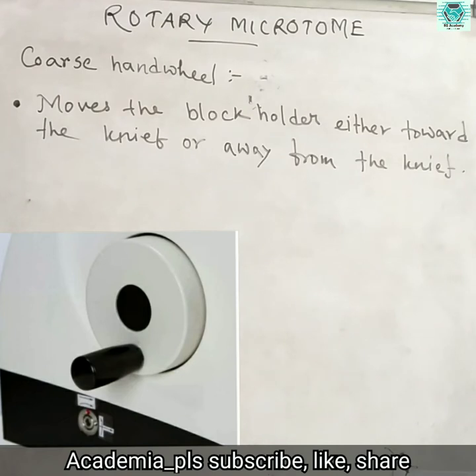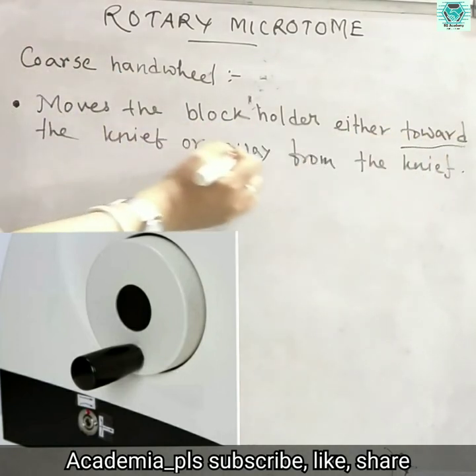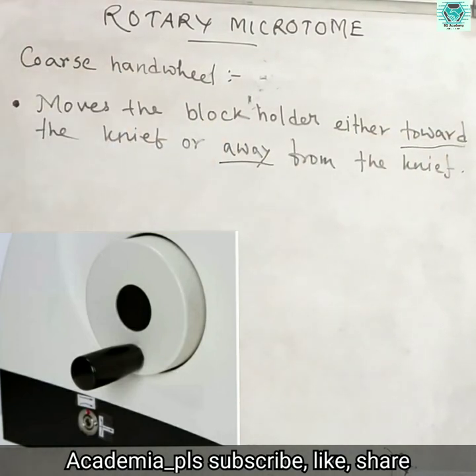Next part is the coarse hand wheel, which is used manually, and it moves the block holder either toward the knife or away from the knife. The diagram below also shows that part.